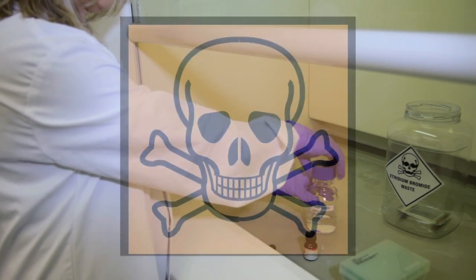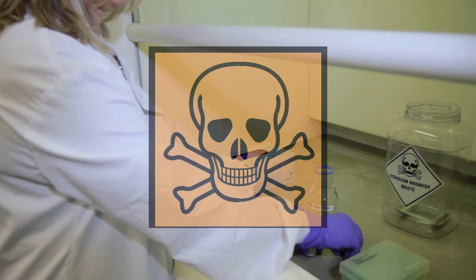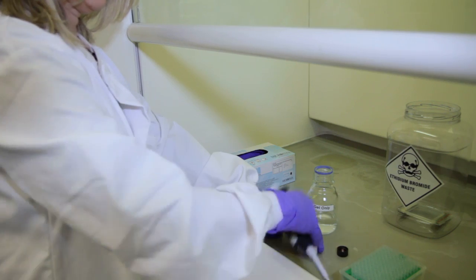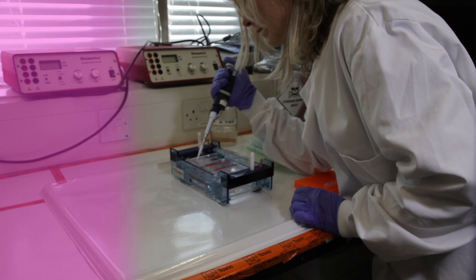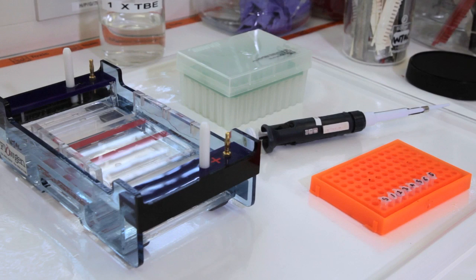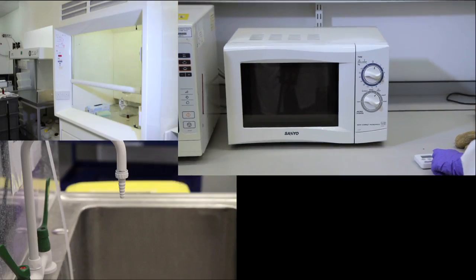There are important safety issues to consider when using ethidium bromide. It is a mutagen that intercalates and binds the DNA in your PCR product. It is best to assume that everything to do with running gels is contaminated with ethidium bromide. This includes gel equipment and anything in the room used to prepare gels, including the sink, cabinets, microwave and also the camera system.